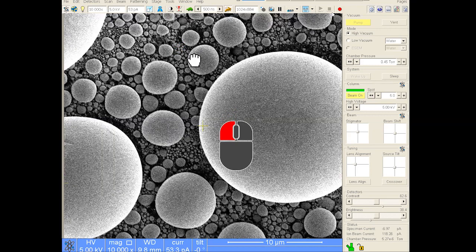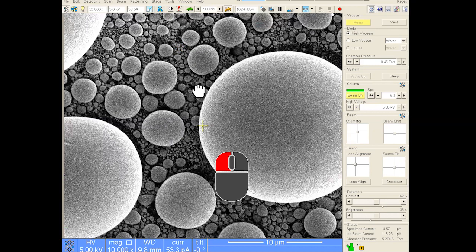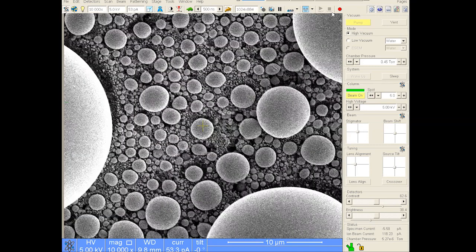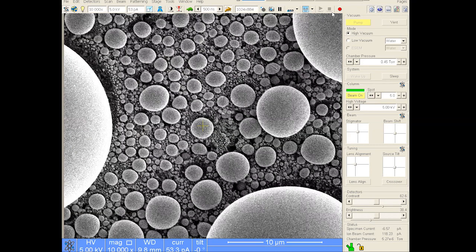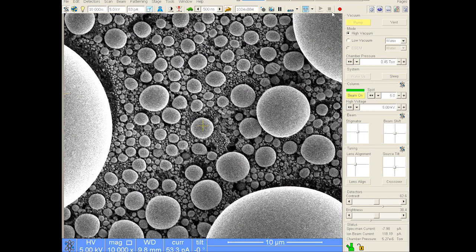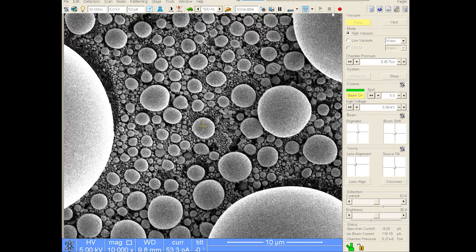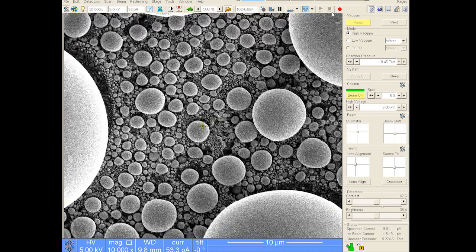My cursor then turns into a hand, and I'm just gonna drag it down to the center. Okay, and it makes it a lot easier. So it basically takes the feature that you want and you can just drag it right to the center rather than trying to zero it in and get it perfect with these left and right. It just makes it a lot quicker.